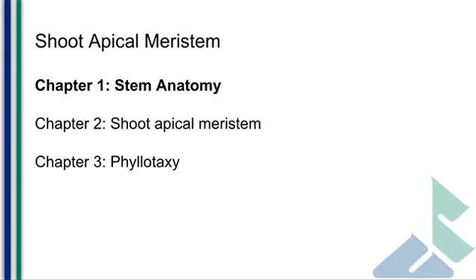In today's exploration, we're going to be looking both at the stem as it's developing in longitudinal section, meaning vertically up and down, seeing how it looks as it grows, that primary growth, the lengthening of the plant, as well as what happens when that primary growth begins to specialize and mature, eventually forming all the different tissue layers that we see in a plant stem.